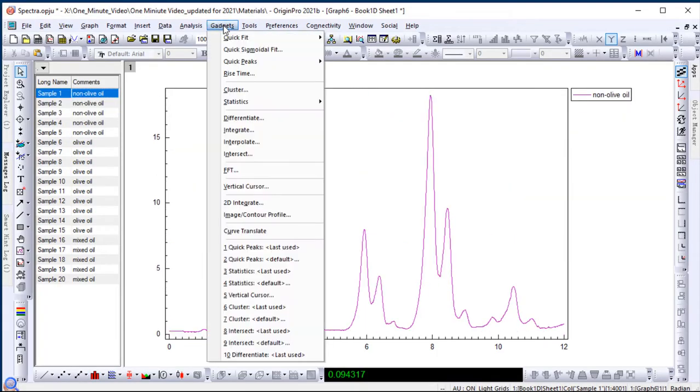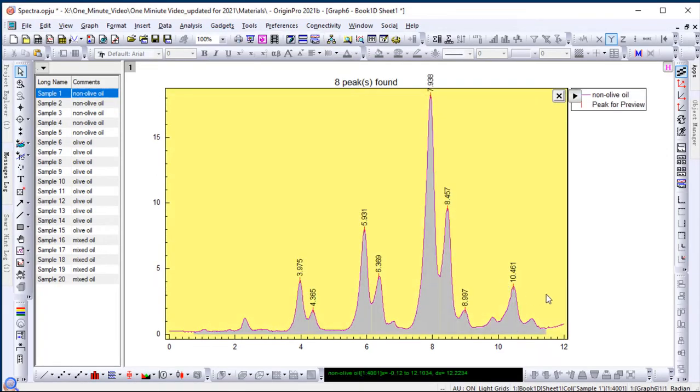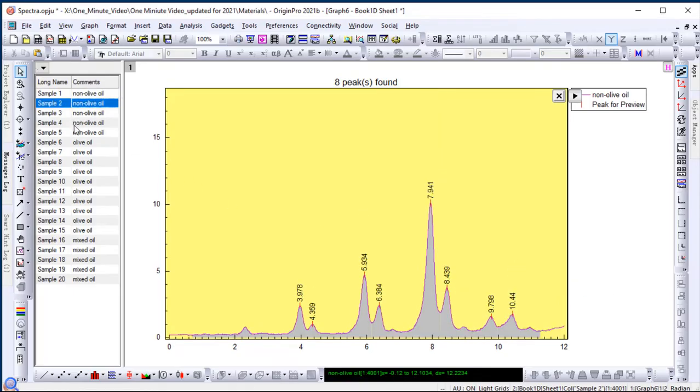Add a gadget to analyze the data. Results update as you switch from one dataset to another.